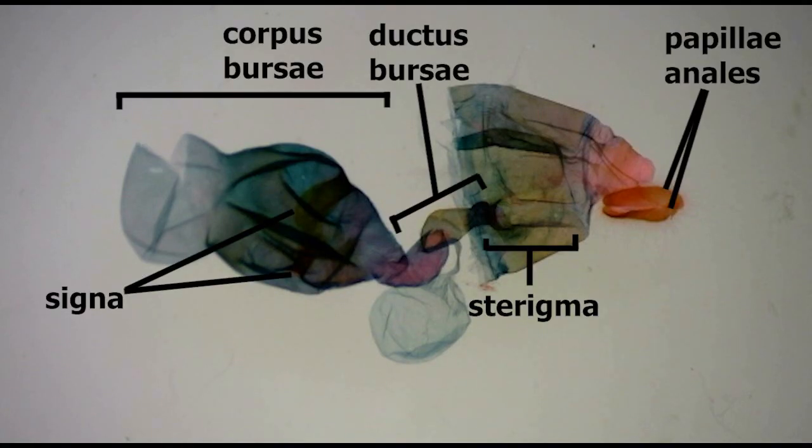Also just like it is in the male, I can place the genitalia under a coverslip in a shallow well microstrip slide for photography or closer examination.